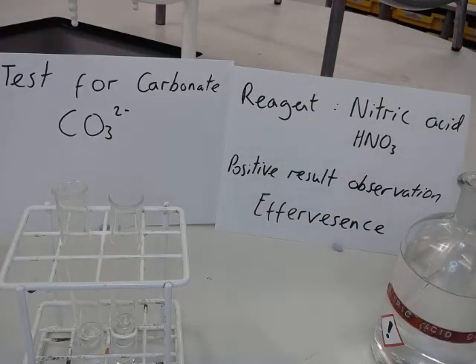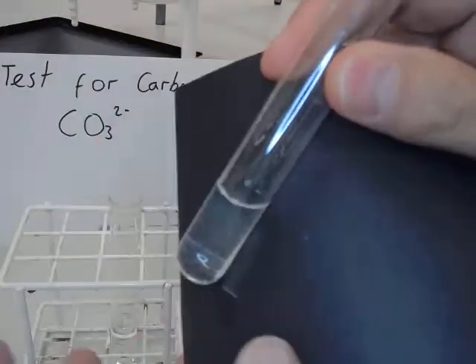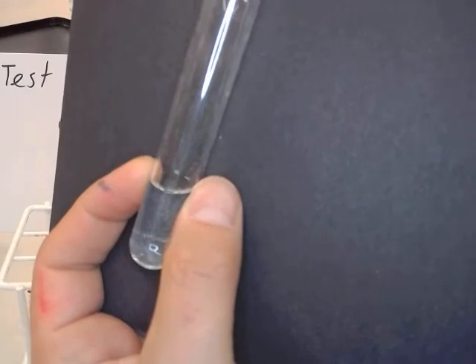Now this test can be tricky because the reaction happens quickly. It doesn't bubble for a long time, so we've got to keep our eye on it. I'm going to do it just on a black screen just to see if we can get a better view on whether there's any bubbles or not. Okay, so let's try it.